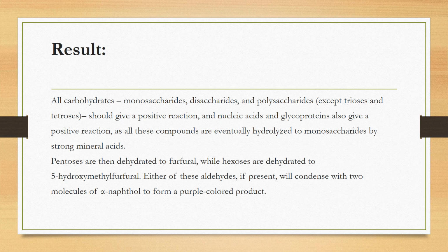The result: all carbohydrates, monosaccharides, disaccharides and polysaccharides except trioses and tetroses should give a positive reaction for Molisch, and nucleic acids and glycoproteins also give a positive reaction, as all these compounds are eventually hydrolyzed to monosaccharides by strong mineral acids.